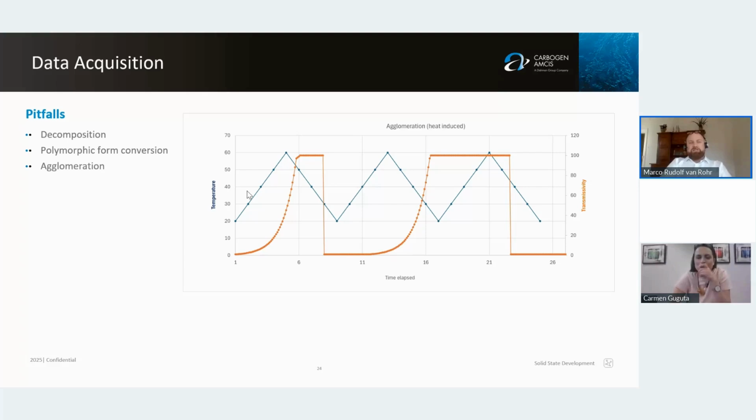You can try to flatten your heating a little bit, or what we sometimes do is we do it in a reactor with IR solubility measurement, or even better, we have a camera which makes a movie next to the reactors, so we can check with our bare eye what is going on. Sometimes with this technology you see ghost signals.